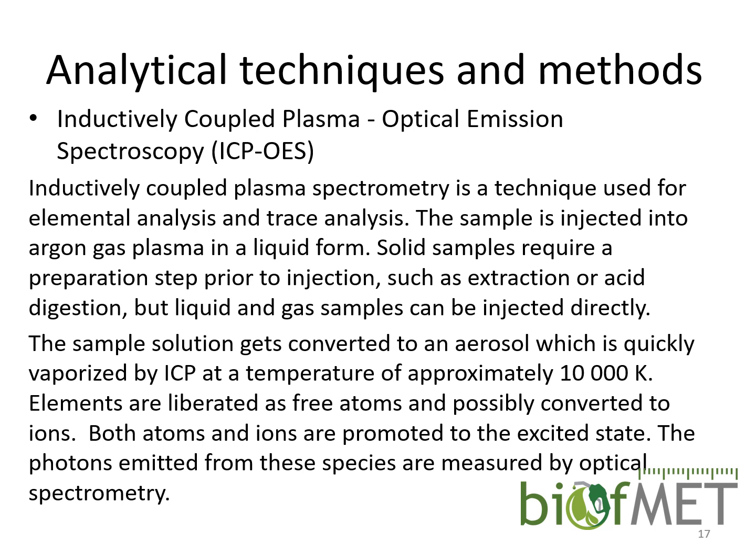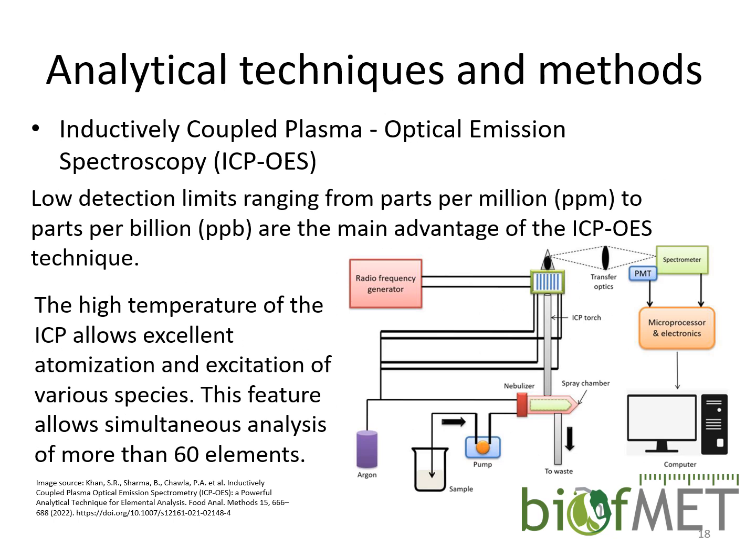That means that you will actually record the ionic spectra of certain elements. Of course, each element can have different ionic spectra, so it can emit at different wavelengths, so you can choose whichever wavelength is more suitable in this particular matrix in order to evade, for example, some spectral interferences, other elements present in a sample, and so on.